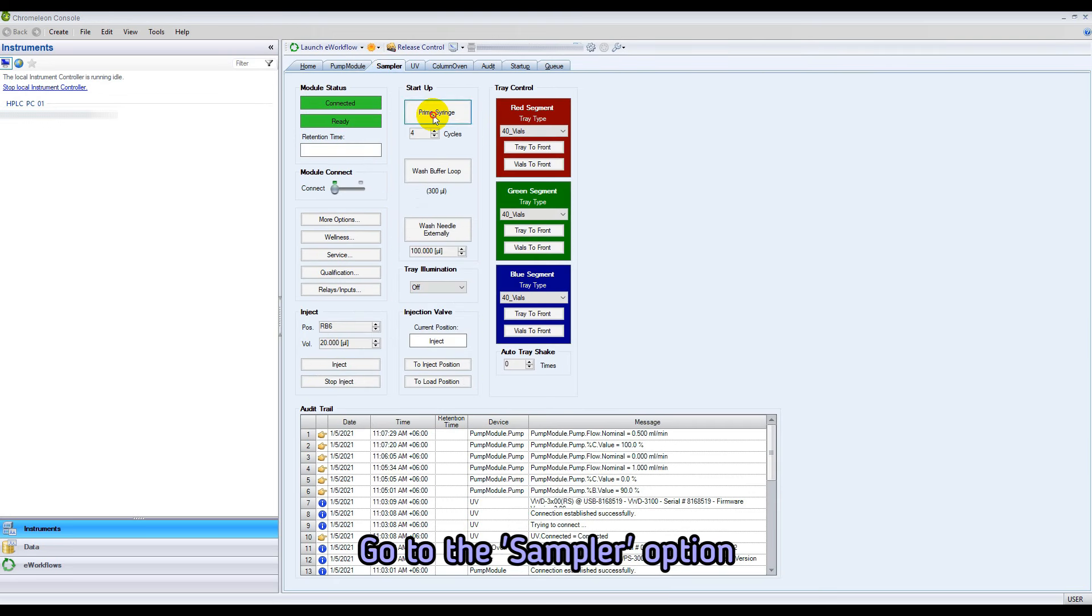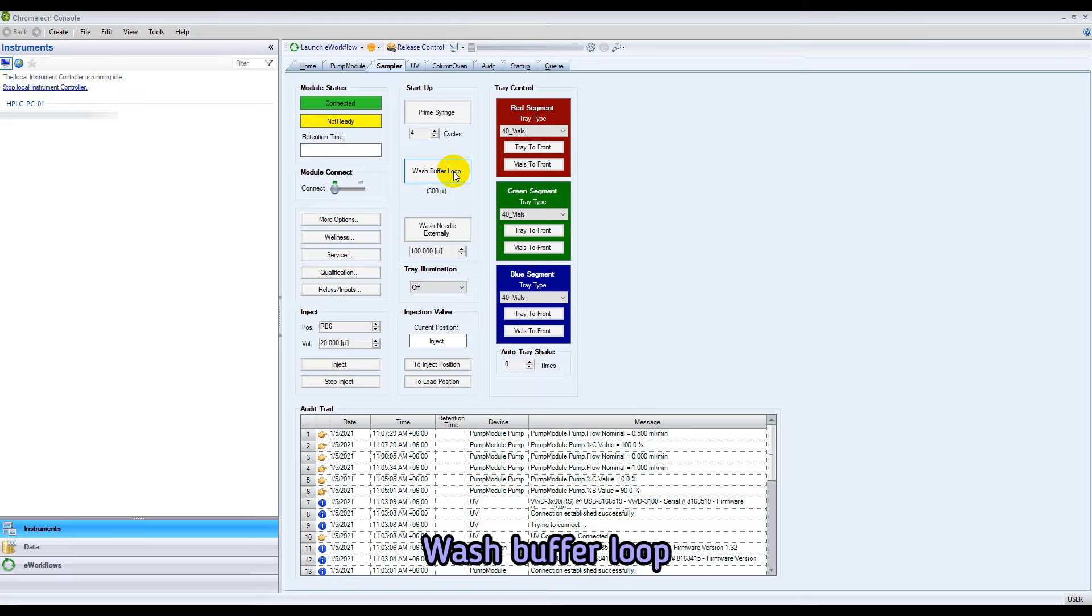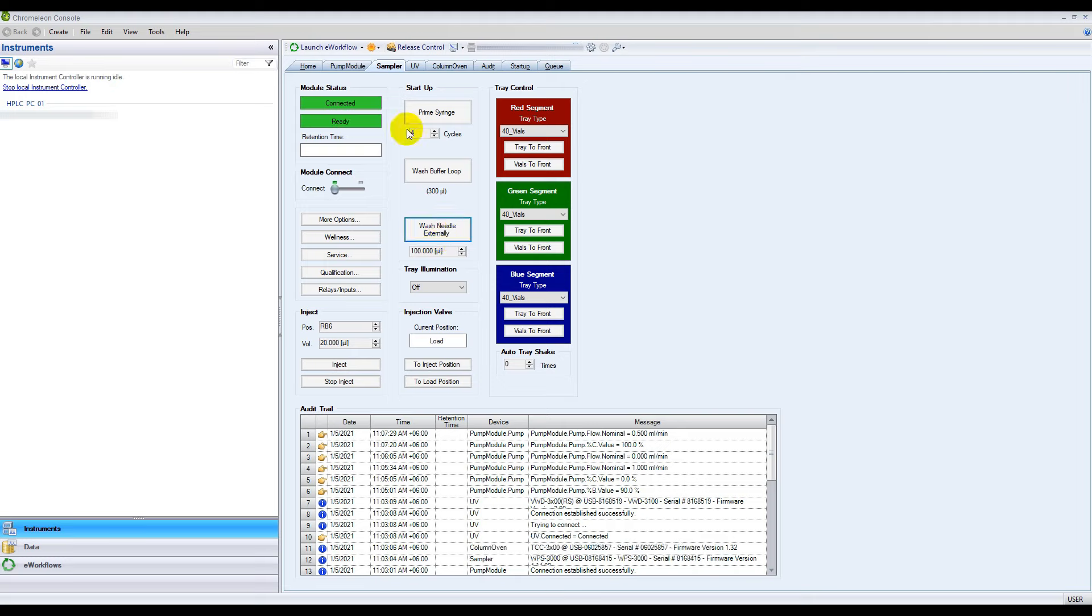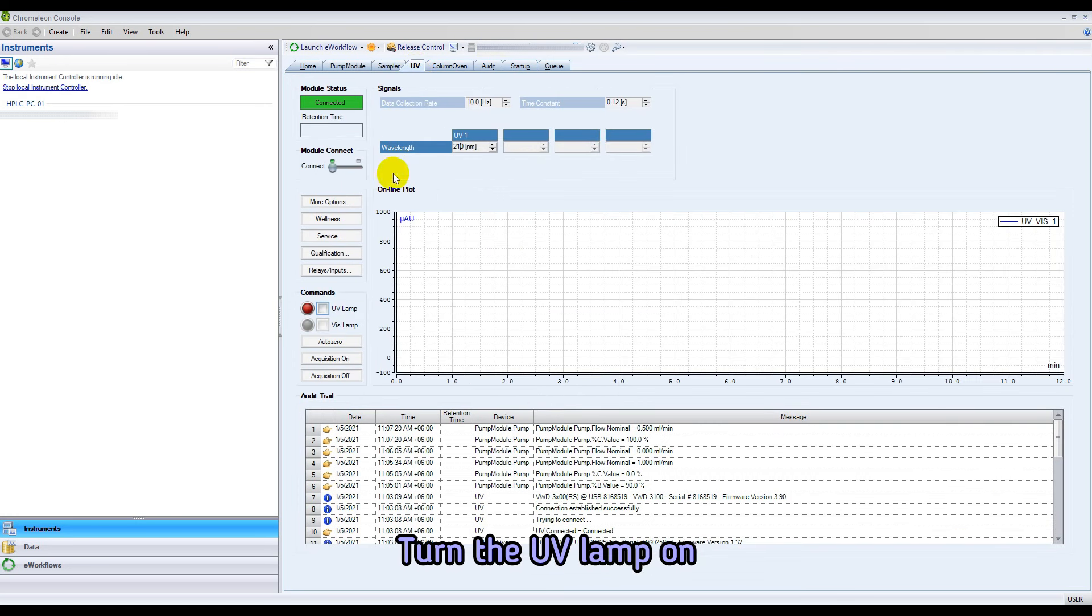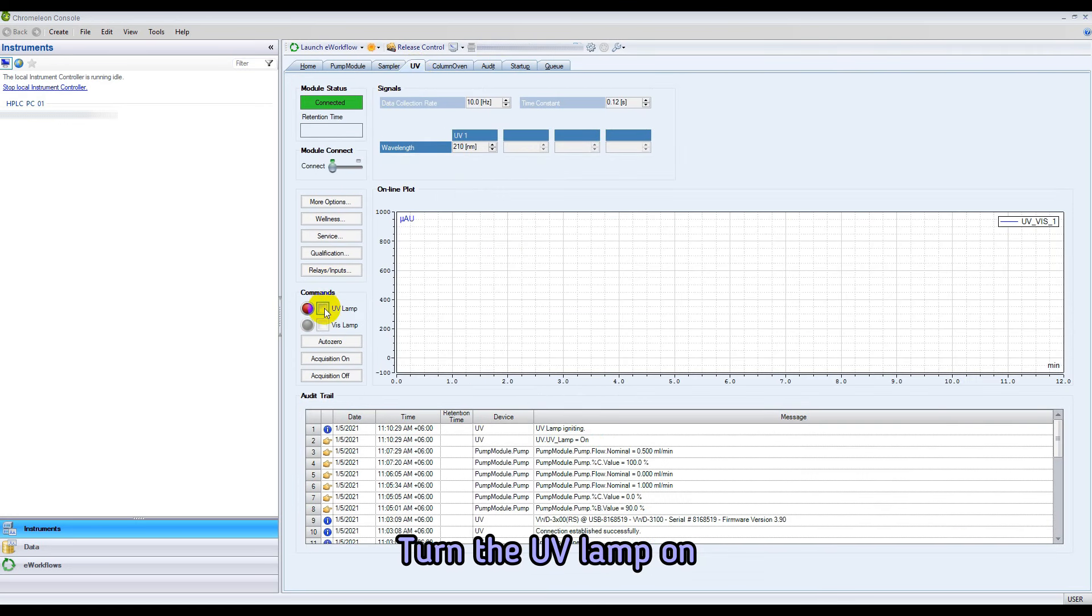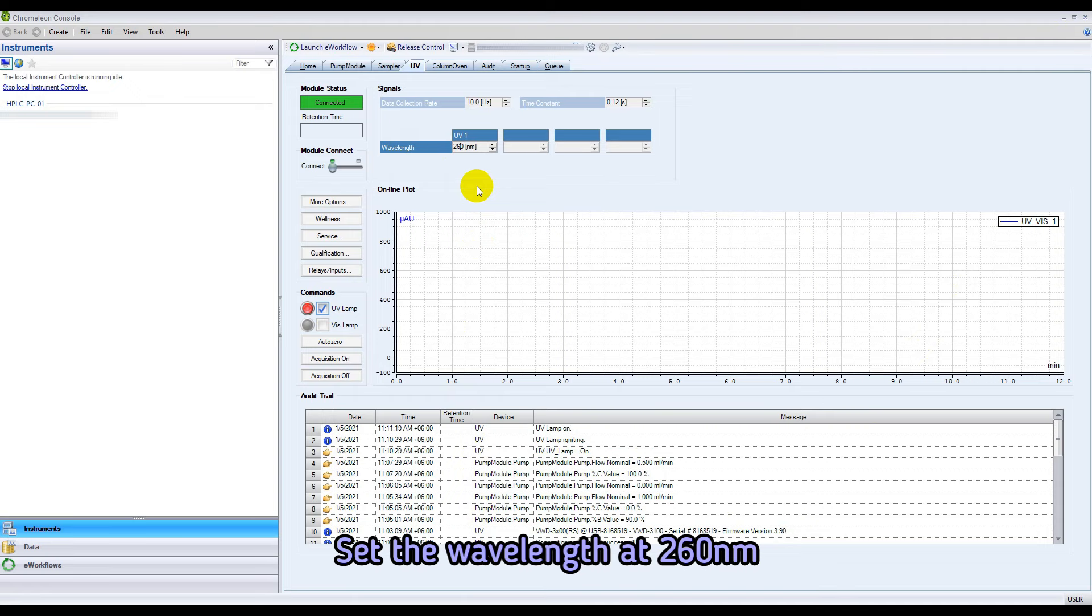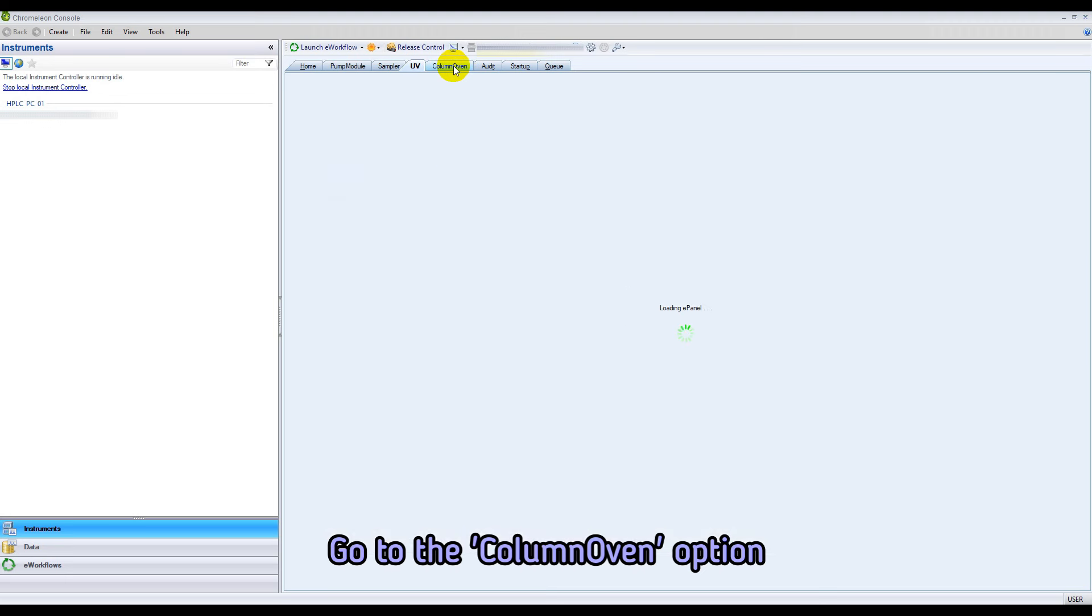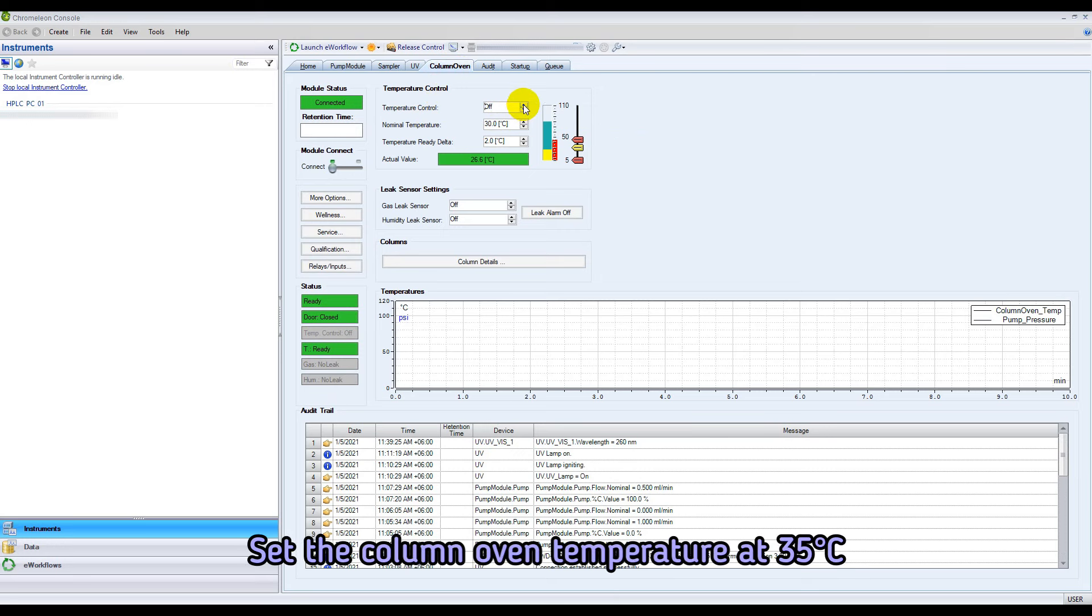Wash prime syringe. Wash buffer loop. Wash needle externally. Turn the UV lamp on. Set the wavelength at 260 nanometer. Set the column oven temperature at 35 degrees Celsius.